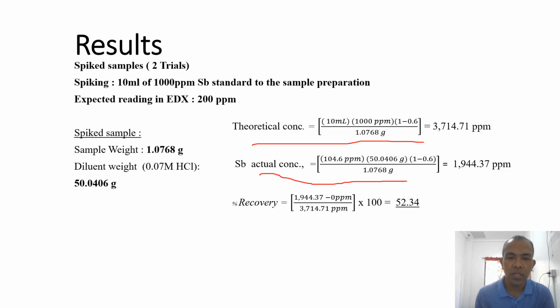So this is the actual concentration here. So around we have 52.34. So we have a poor recovery.